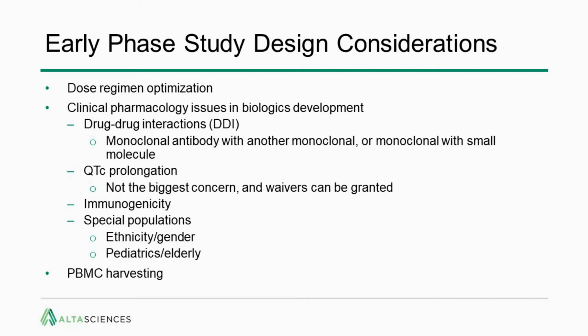And finally, PBMC cell isolation and harvesting, a very, very intricate and complex bioanalysis that needs to take place to really get the big picture of what the biologics are causing in the human body.